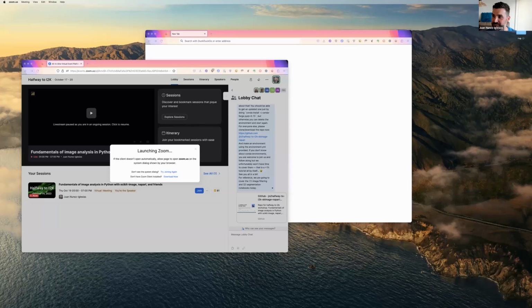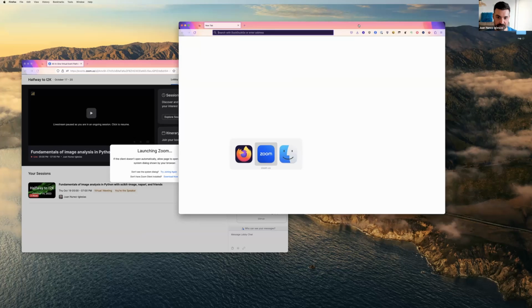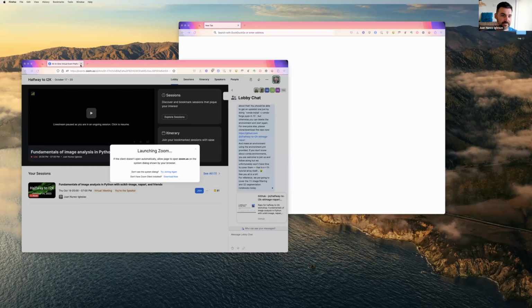All right, sharing my screen. Move this stuff out of the way. Okay, so can you all see my browser? I hope so. Thanks. Look at this thing.